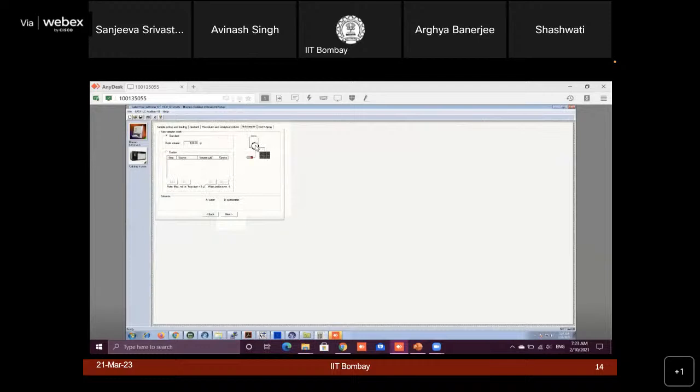This is the autosampler position, where you can see what samples are placed and at what position. And this is the Easy-nLC nano spray, from here the nozzle will spray. Okay, so now you move on to the main machine, the Orbitrap mass spectrometer.